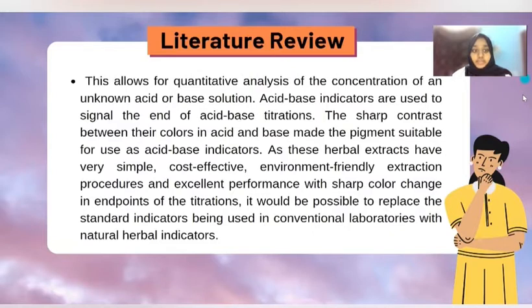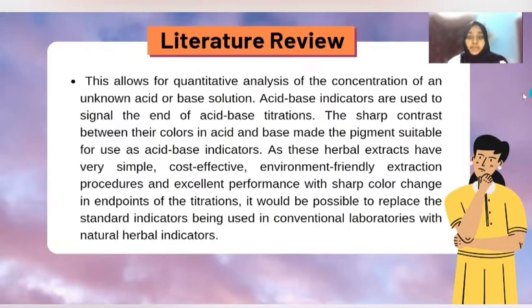The sharp contrast between their colors in acid and base makes the pigment suitable for use as acid-base indicators. As these herbal extracts have very simple, cost-effective, environmental-friendly extraction procedures, and excellent performance with sharp color change and endpoints of titrations, it would be possible to replace the standard indicators being used in conventional laboratories with natural herbal indicators. Now I will pass on to Cheryl to continue further.